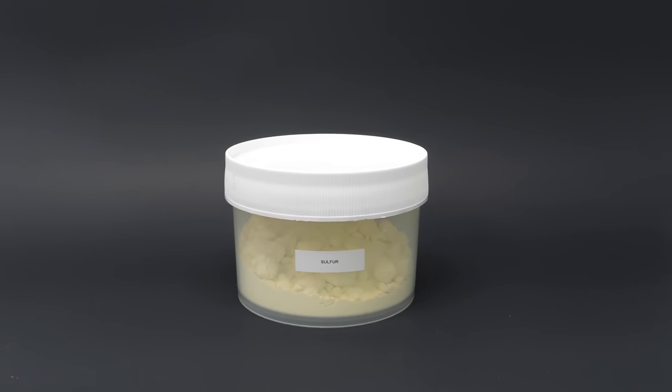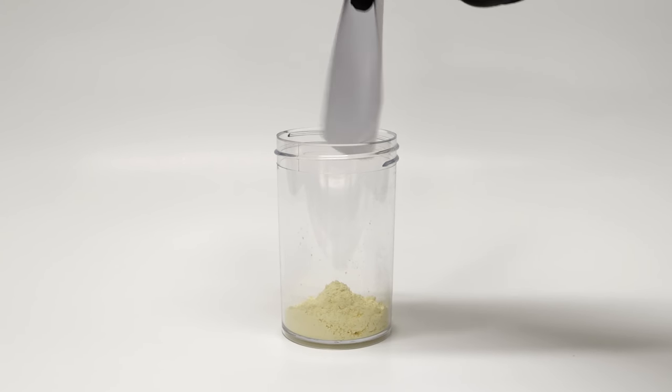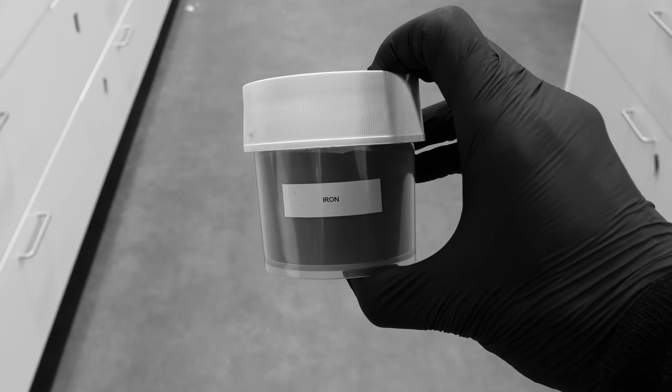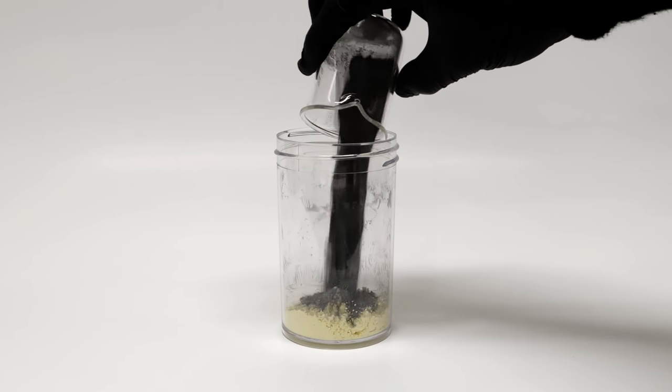I've decided to do one of my favorite reactions. The first thing I need is some sulfur — I'll just add about 20 grams to a little container. On top of this, I also need to add some powdered iron metal, and I measured out about 35 grams.